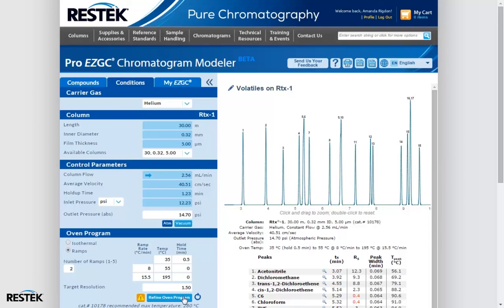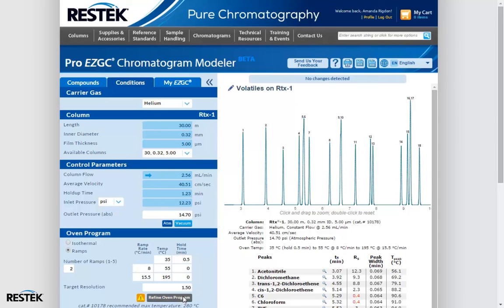We can see that the Refine button is still blue, which means that there may still be a better optimized temperature program to be found. Since our separation is still looking pretty good, except for our co-eluting compounds, let's go ahead and refine again. Now the Refine button has been grayed out and no additional optimizations were possible with the software.